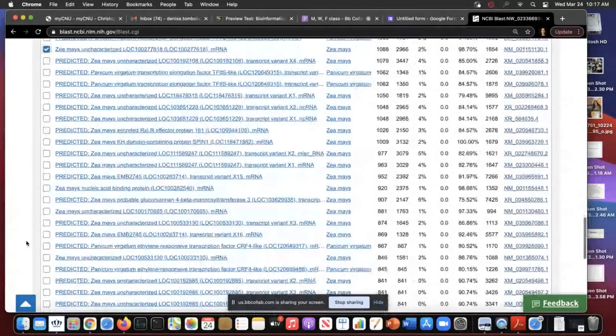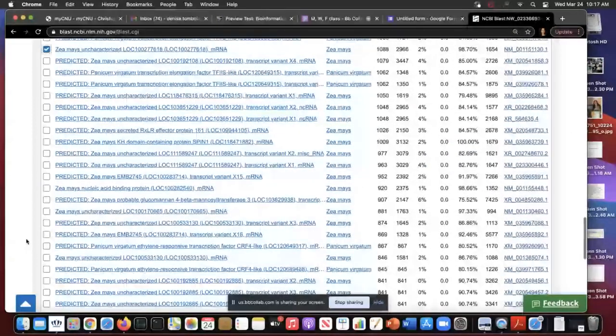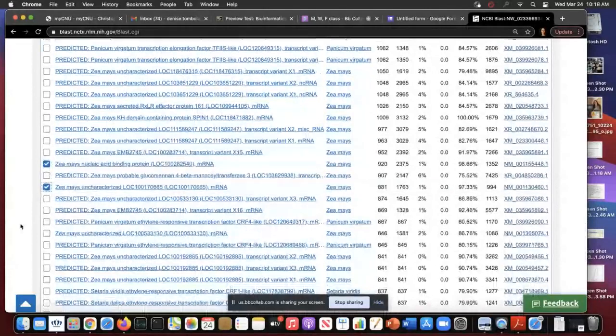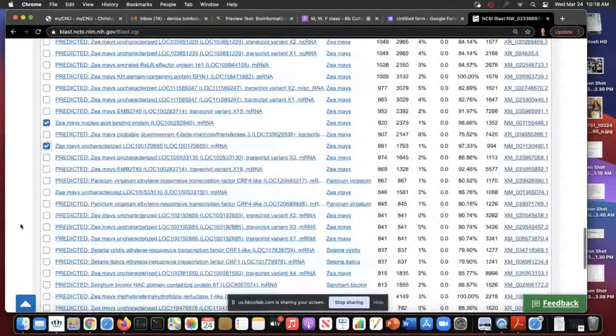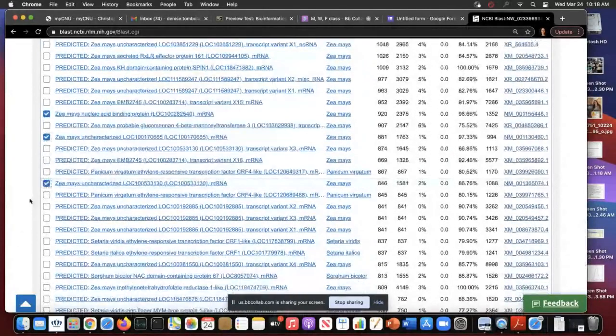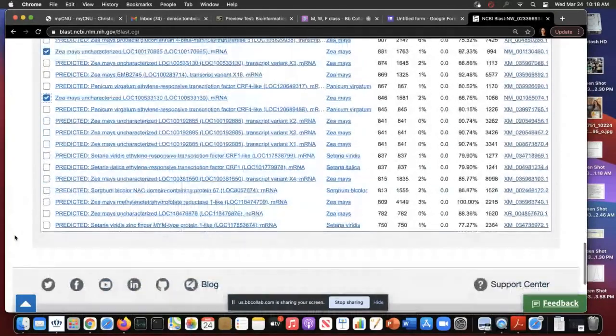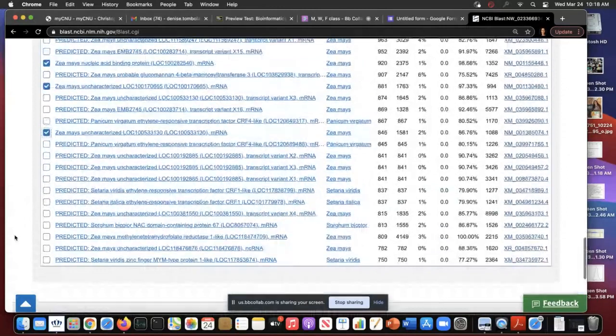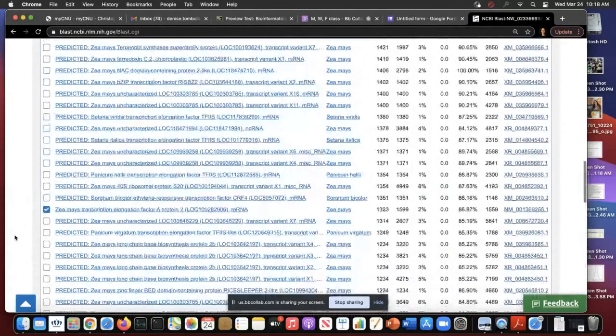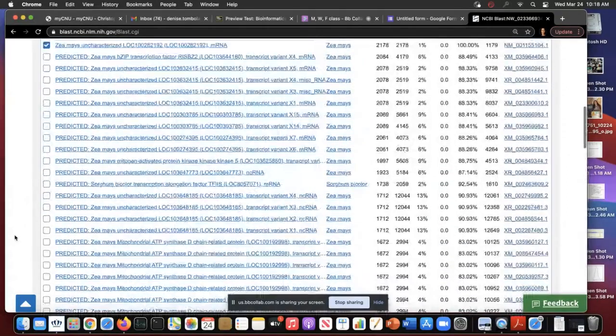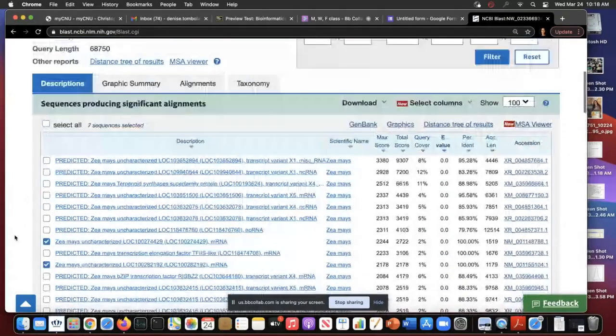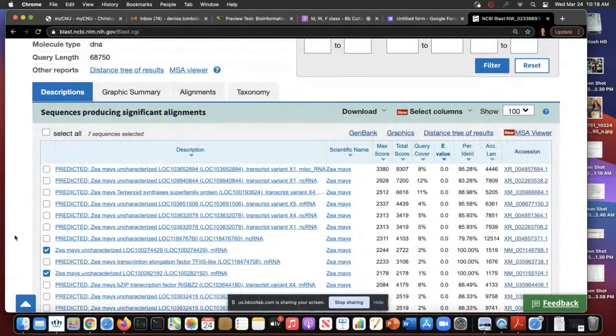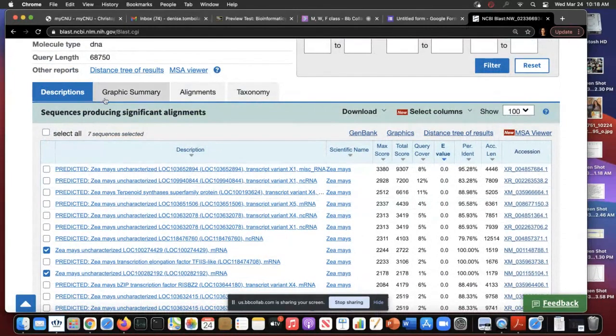I'm just going to do the first hundred, which is what this page shows. If I want to see where these mRNAs match my genomic sequence, I'm going here on graphic summary.